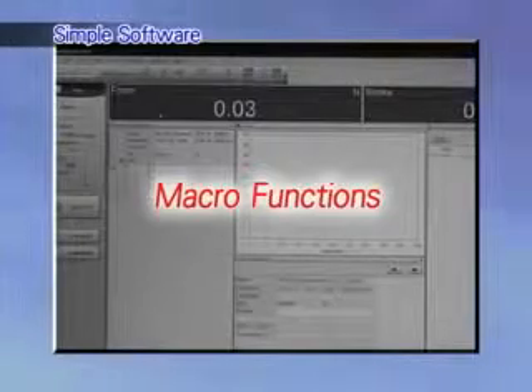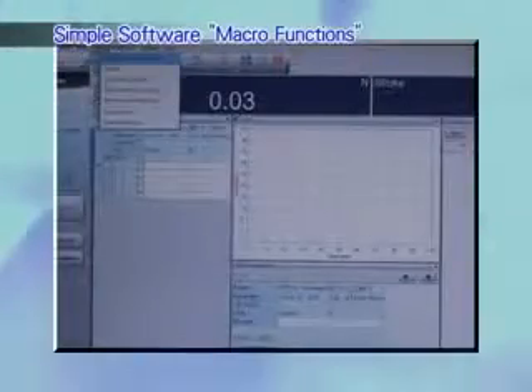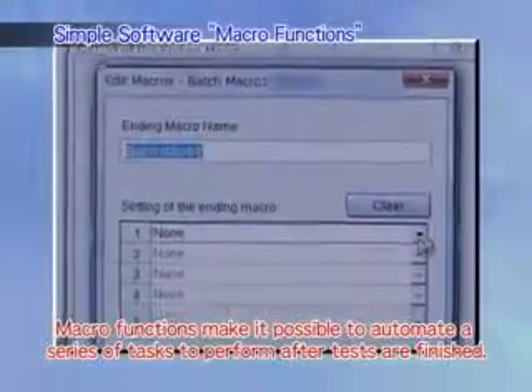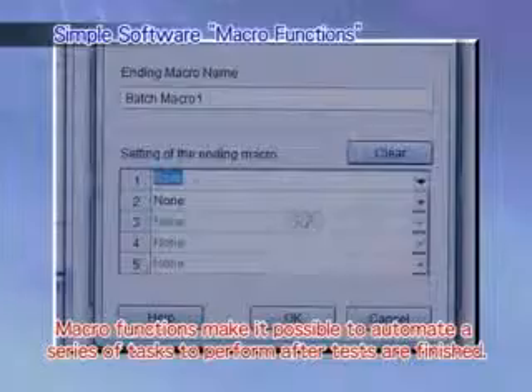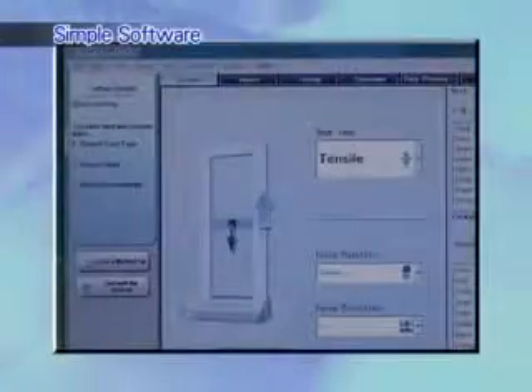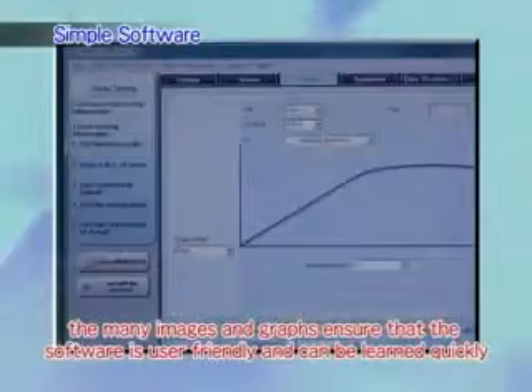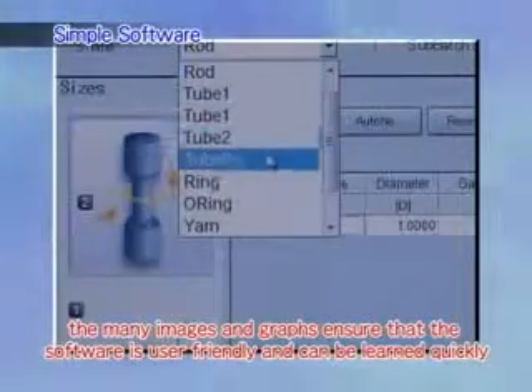Macro functions make it possible to automate a series of tasks to perform after tests are finished. By coordinating with the AGSX unit, macro functions let you save test data or print reports, all without touching the computer. In addition, the many images and graphs ensure that the software is user-friendly and can be learned quickly, even by those using it for the first time.